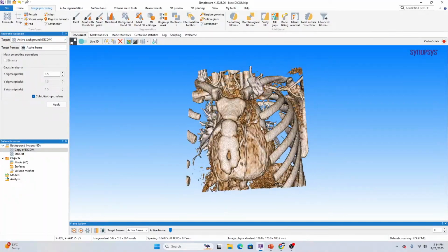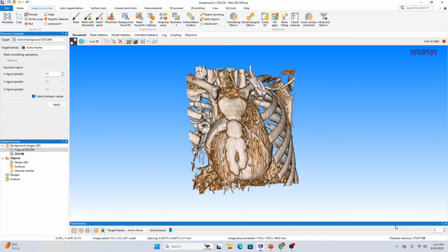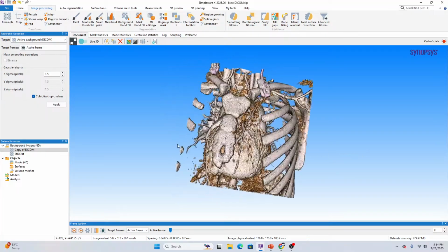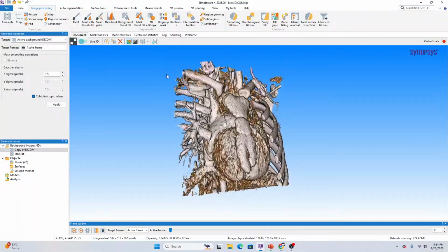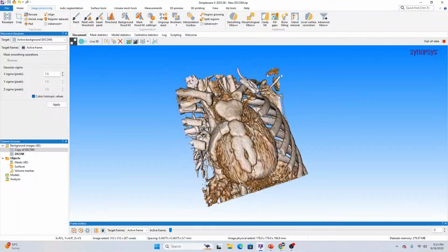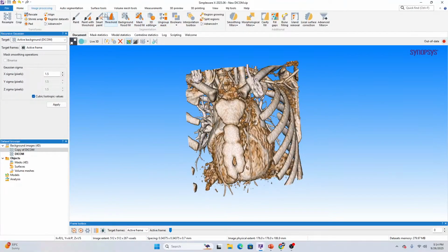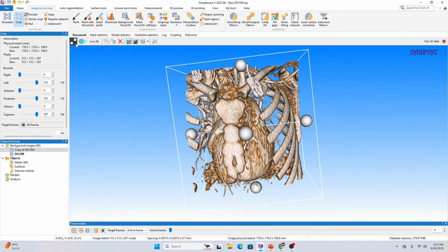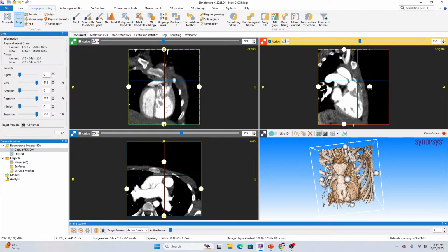Now, whenever we are dealing with such a data set, if we need to focus on the heart-specific data, the memory currently required is around 280 MB. That's quite a significant memory requirement, because once we start the mask creation, the memory will increase further and put more load on the system. So the first thing we can do is crop this particular data set. These are all optimization techniques that we can use to work on the data.